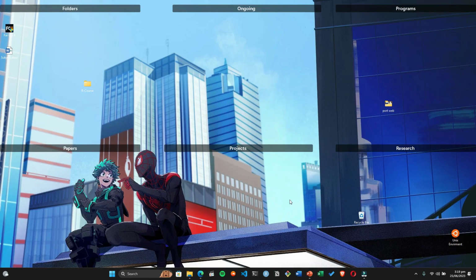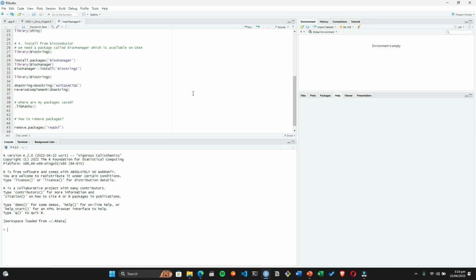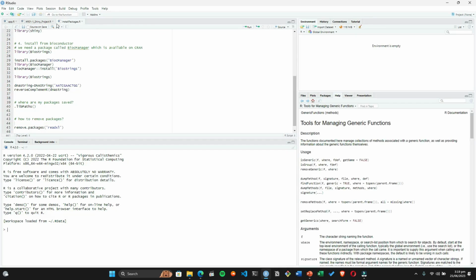So we are going to open our R window, opening RStudio, and we are going to use RStudio for our differential expression analysis. Let's just wait while R is loading, and then we are going to use our operating system. Yes. So here we are.